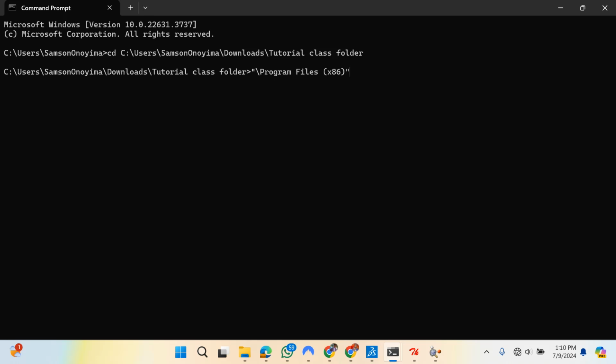It will reach the end and it will return to that. Is that alright? So I found the folder. Then inside this, Program Files exists. I'm looking for... yes, it's for all systems. You have Local Disk, you have Program Files. This is where the system automatically installs software. Alright? So inside this, I'm looking for the Scripps Institute.